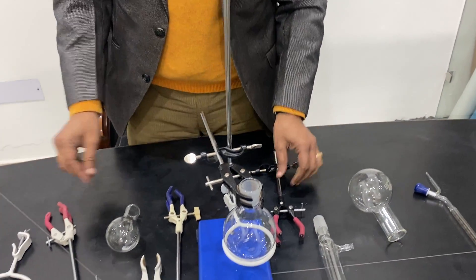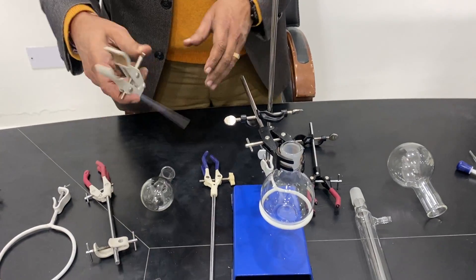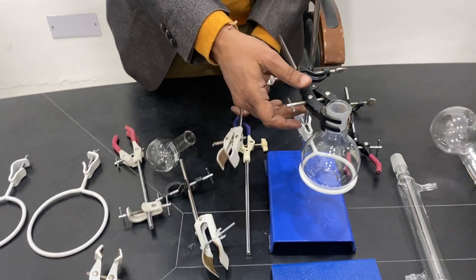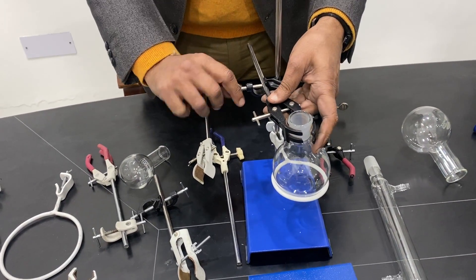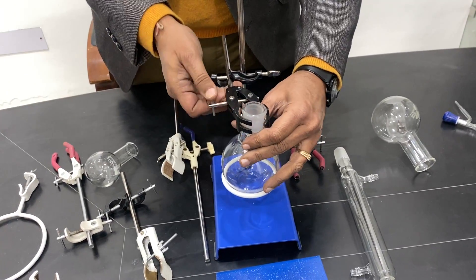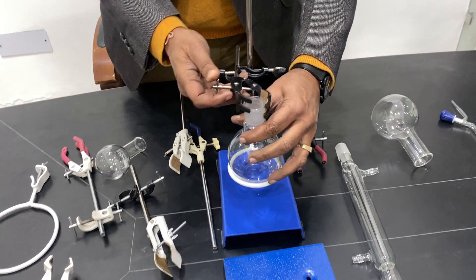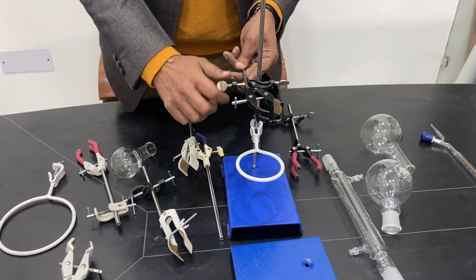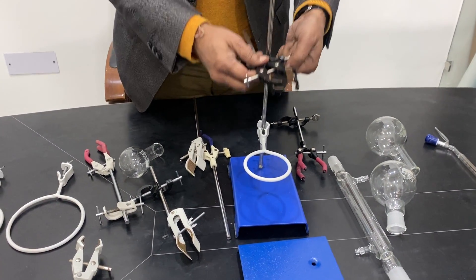Sometimes people use the strip-type boss head for holding the burette, similarly to how it is used for a flask. Any clamp can be used for holding the flask or burette. Let me show you how this is used.